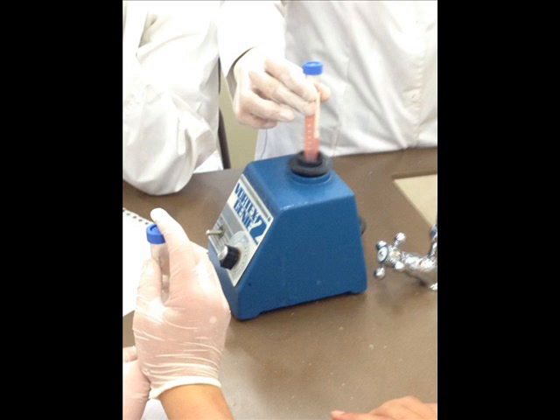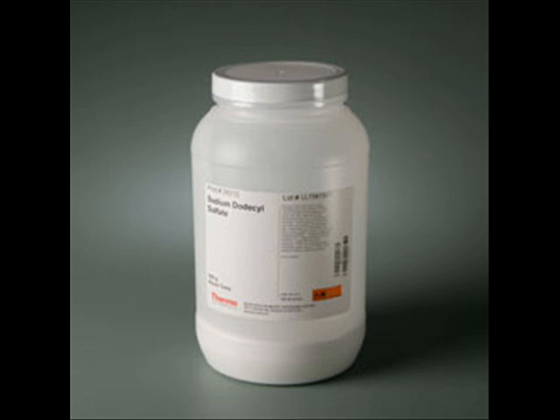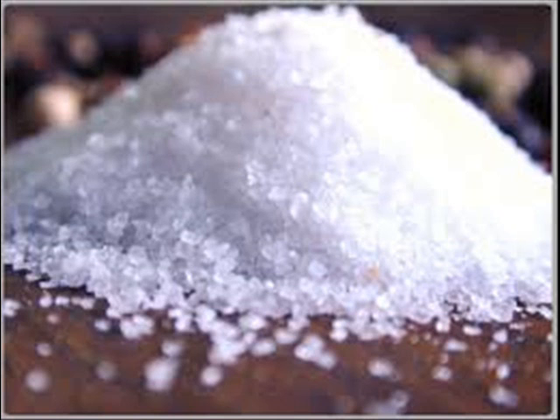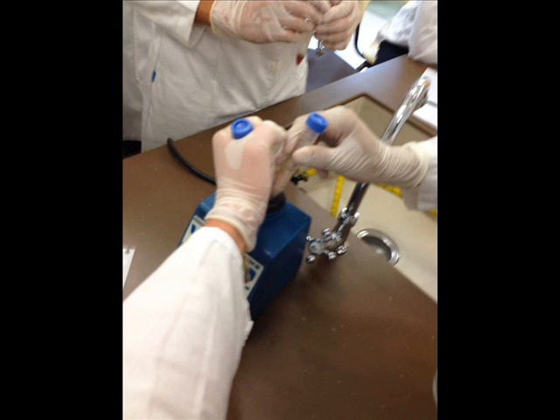Later on, we add 67 microliters of SDS and apply it 1 minute into a vortex. Then we add 10 microliters of proteinase K and after we shake softly, we add 335 microliters of NaCl and apply it into a vortex for 1 minute.